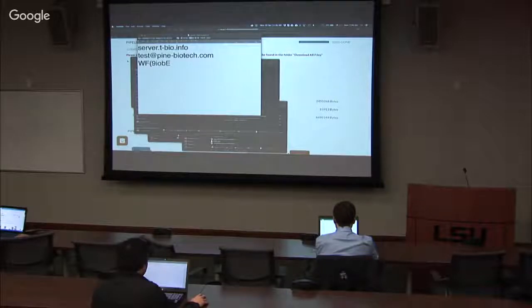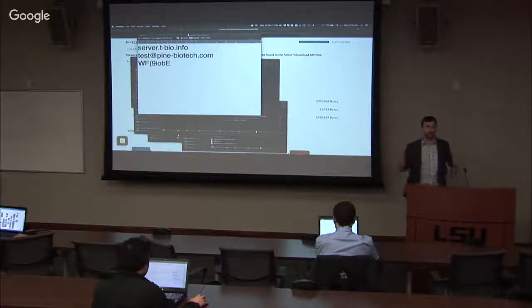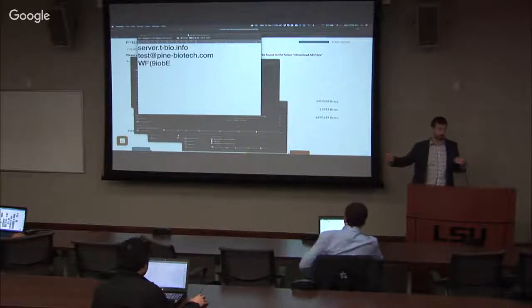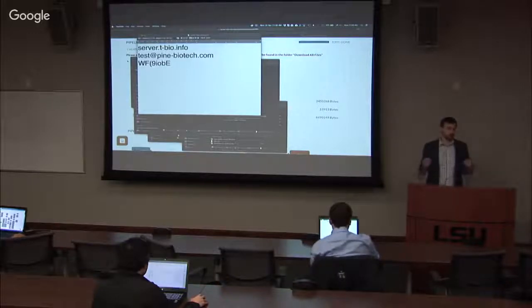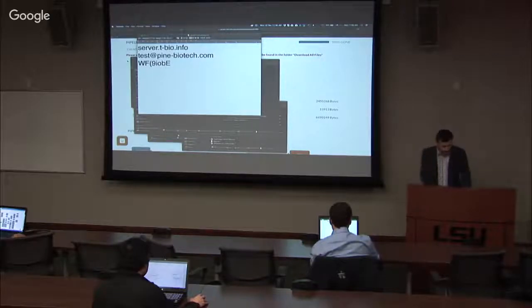So it takes all of your genes, and it tries to find the variance associated with the whole data set. Not for each individual sample, but with the whole data set. And it does a projection in this multidimensional space that we can't see, but PCA can, which is a vector of numbers. And then you take that vector and say, this is now your x and y coordinates, PC1 and PC2, or PC2 and PC3. We can actually see the coordinate.